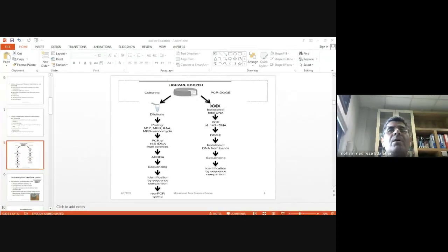As you know, in order to perform the PCR, we require primers, and here these are the universal primers: F357 with a GC clamp, and this is the sequence of the forward primer with a GC clamp, and the other one is the reverse primer, R518, and this is the sequence of this primer from 5' to 3'.